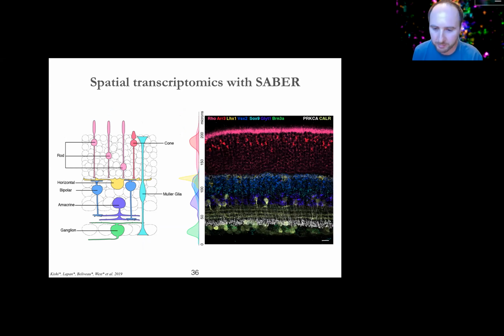And coming back to the theme of the symposium, I think the power of this, given that it really seems to have a sweet spot for imaging dozens of targets, something like that, in cell and tissue samples, is applying it to spatial transcriptomics. So you go from your single cell RNA-seq information, picking out 1 or a few marker genes for each cell type you're interested in that dropped out of the clustering based on differential or exclusive expression, and then doing this multiplexed FISH to reveal the patterns of these in the spatial context.